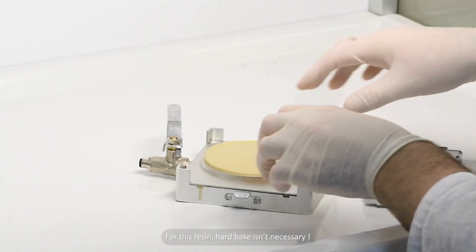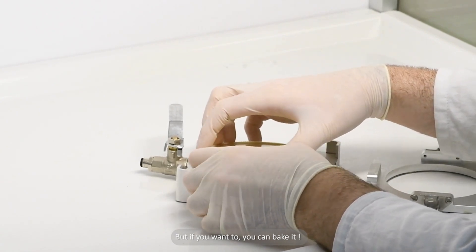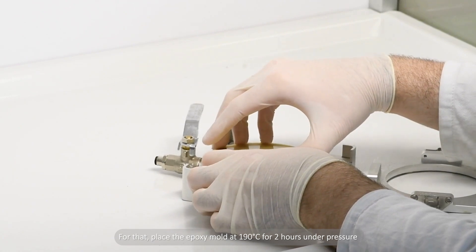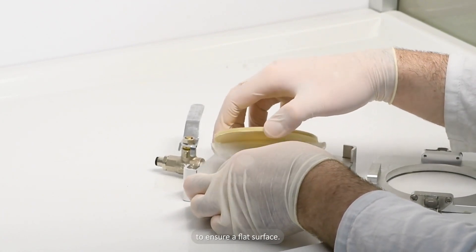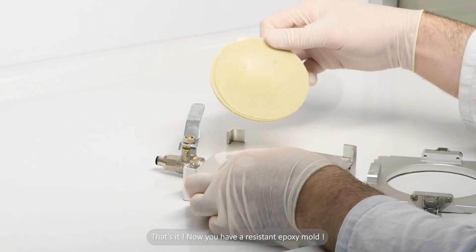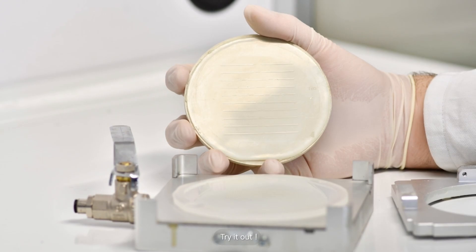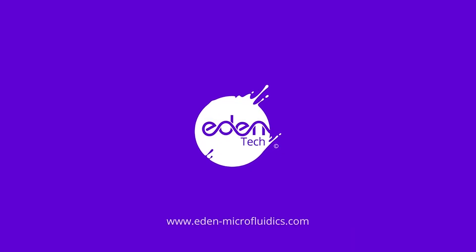For this resin, hard bake isn't necessary. But if you want to, you can bake it. For that, place the epoxy mold at 190 degrees Celsius for 2 hours under pressure to ensure a flat surface. That's it! Now you have a resistant epoxy mold — try it out! For more questions or queries, don't hesitate to visit our website.